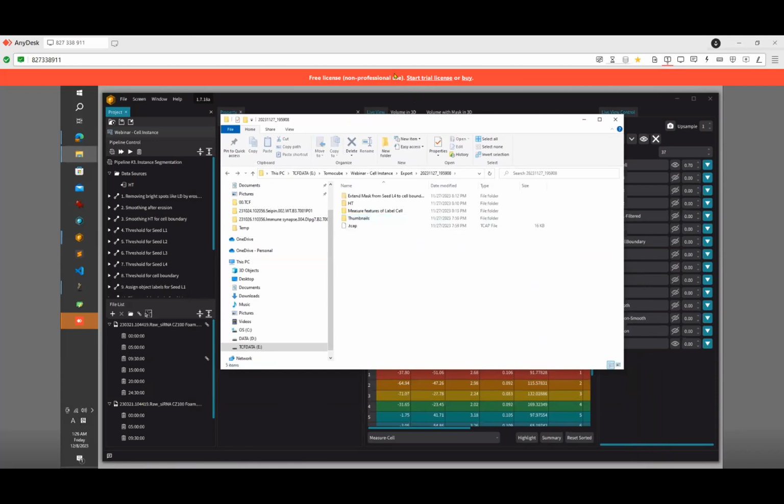And I believe someone asked in the Q&A session whether the cell instance ID will be conserved when performing segmentation across time points. Yes, that's the portion of tracking. So at this moment, the tracking is not available, so you should do it manually at the moment.